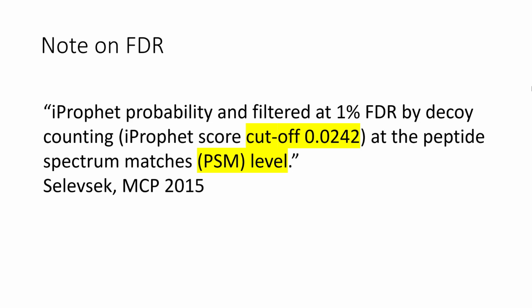Yeah, they still want reviewers to accept the results, but the main goal was that we want to do a large-scale study. It was a large data set paper, and they did other things. It's a really great data set. It's been incredibly valuable to the field and to us. But if they were trying to report something clinically, no way. Show me the SRM study, show me the targeted study. But in terms of just trying to prove the concept that we can create a proteome-wide library, a big library.